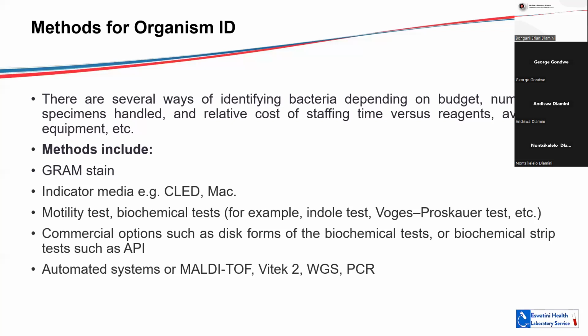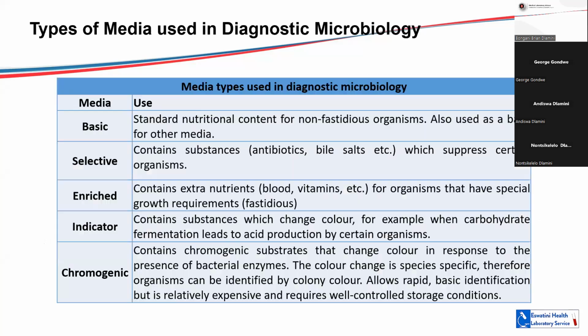So we have different types of media that we use. Some laboratories may choose to buy readily made media, but currently in our laboratory, we prepare our own media. I'm speaking for Mbabane Government Hospital Laboratory. So we prepare our own media, although buying ready-made media can save time in pouring and also will ensure that your media is up to standard, but it's also cost-effective to just prepare your own media where you buy the powders and then you prepare the media.